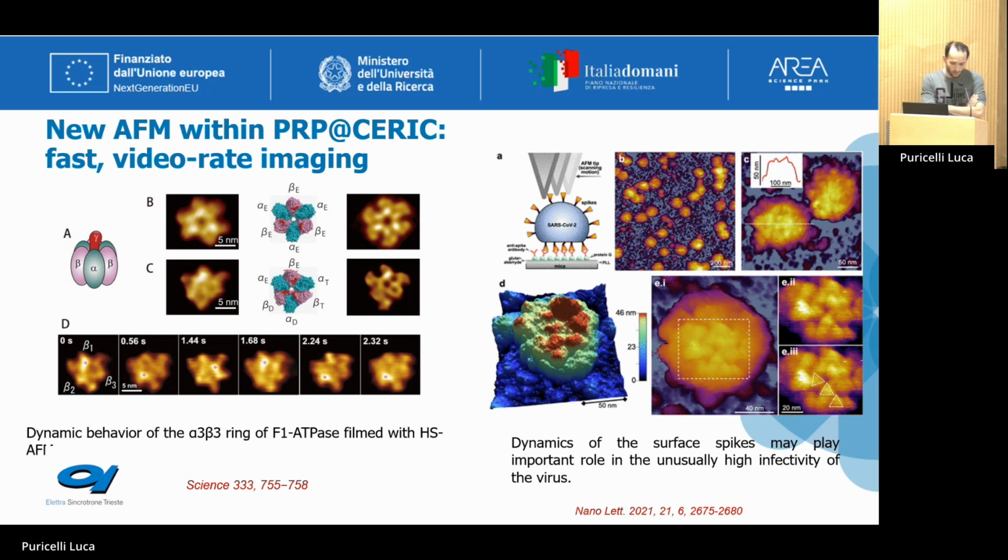That means basically filming the temporal evolution, the temporal dynamics of proteins, or also parts of enzymes, or, as you can see on the right part of the slide, the dynamics of surface spikes, which may play an important role, of course, in the interaction between virus and membranes.